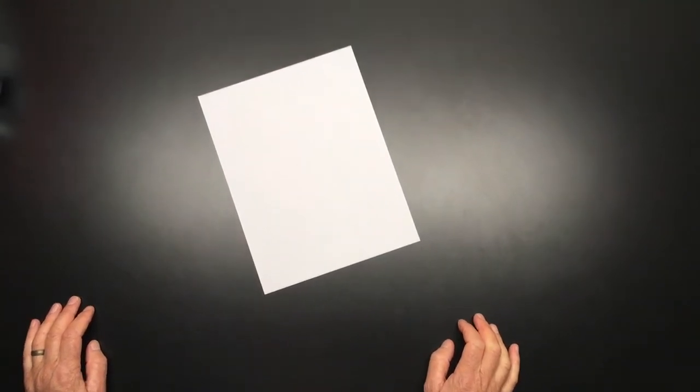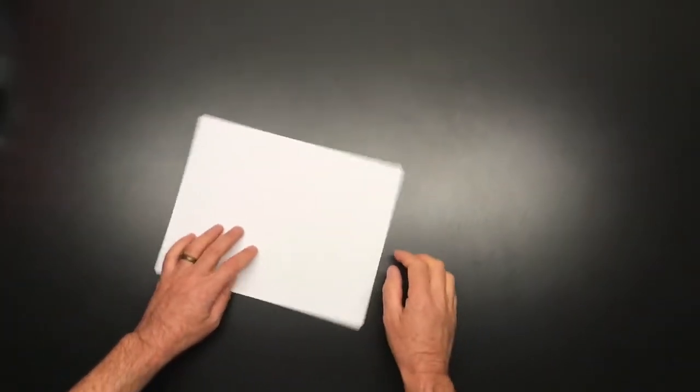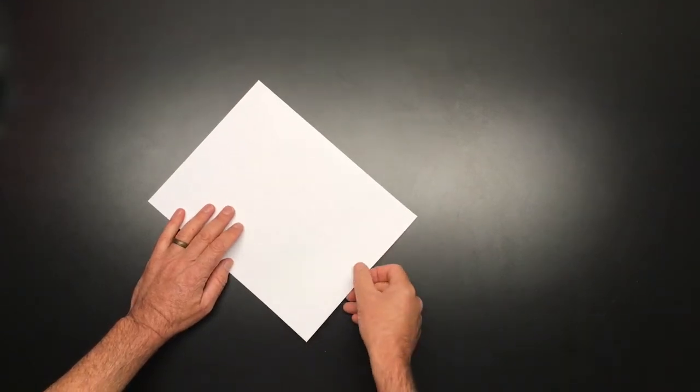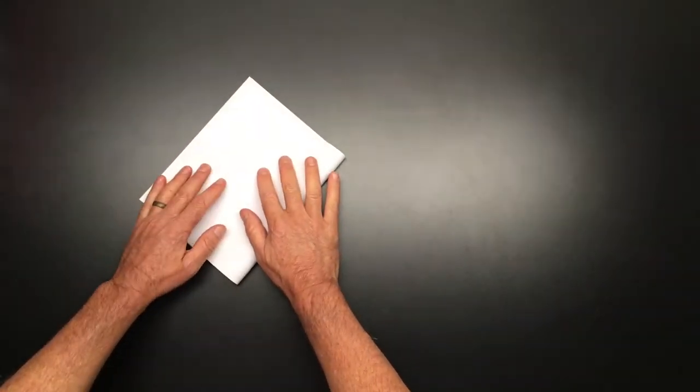This is how to fold a packet for bryophytes or lichens. The first step is to fold the bottom edge up so less than one-third of the top is showing.